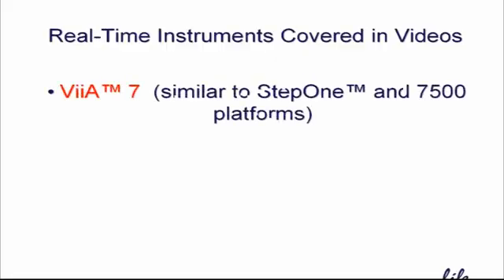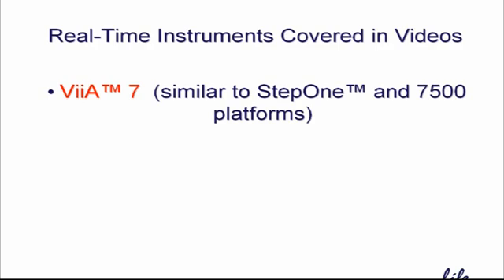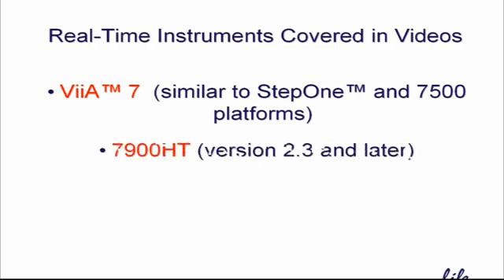We don't have time to show this process for every version of Applied Biosystems software, so I'll be covering the most common ones, including the ViiA 7, which is very similar to the StepOne and 7500 platforms, the 7900HT version 2.3 and later, and the OpenArray qPCR system.